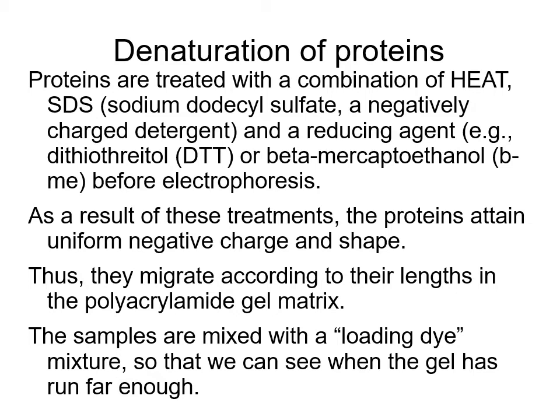Now, proteins don't have any color to them, so if you just load them on a gel and turn the power on, you won't see anything. So the samples are always mixed with a loading dye so we can see whether the gel has run far enough. The loading dye very often contains glycerol in order to keep the sample in the well by making it heavier than the buffer.